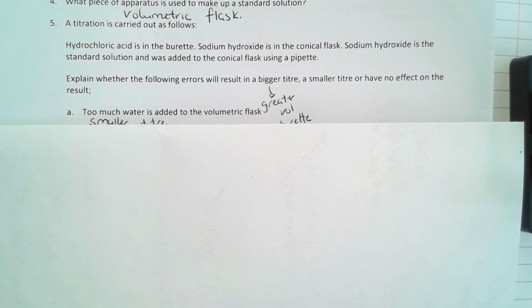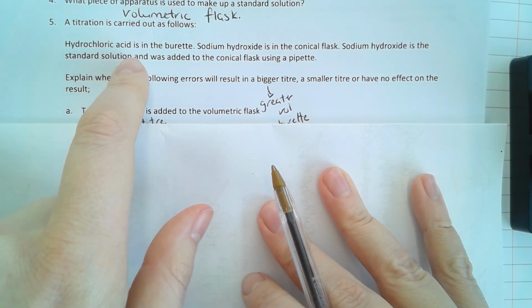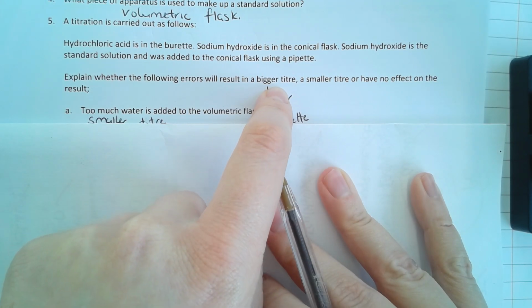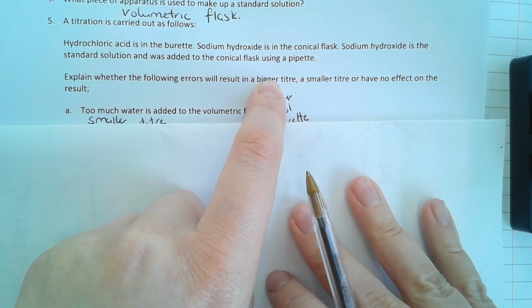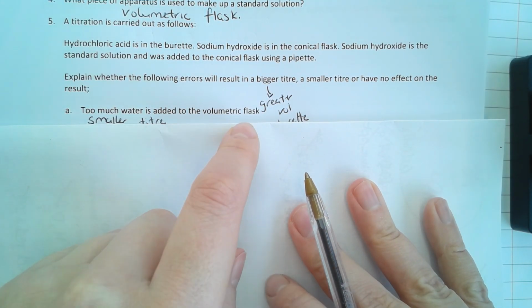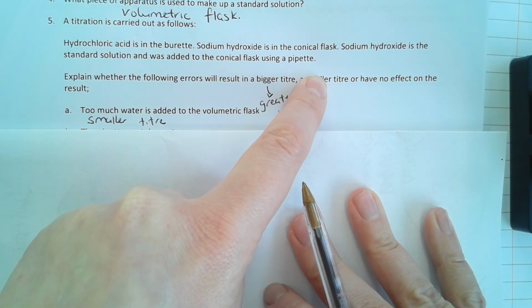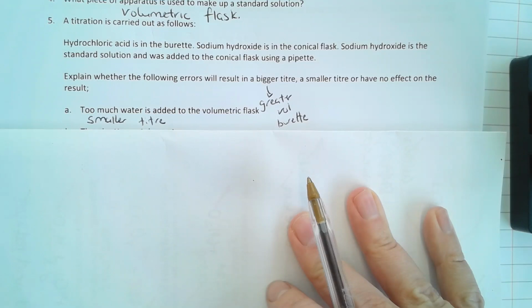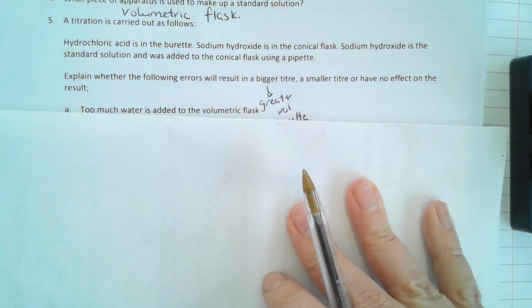So the other question that they seem to like to ask is mistakes a student makes and how it affects the titer. So the titer just refers to the volume being added from the burette. If you're getting a bigger titer than everyone else, that means you're adding more from the burette than everyone else is. Smaller titer, you're adding less to get the color change than everyone else is, and if it has no effect, you're adding the same amount as everyone else to get that color change.